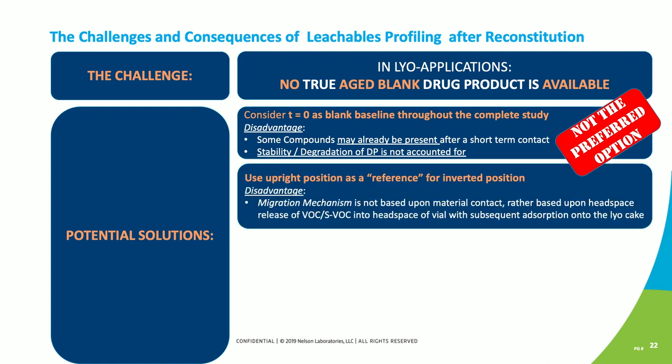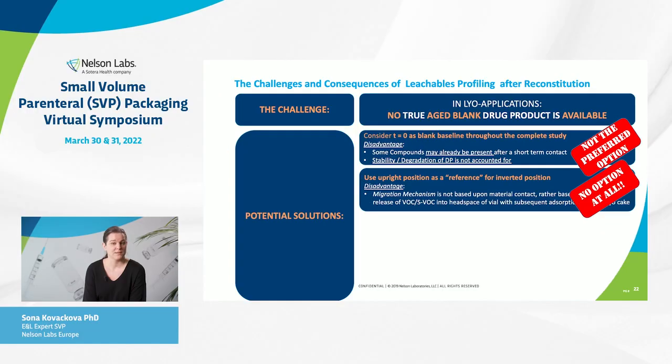The second option would be to use the upright position as a reference for the inverted position. But the mechanism of leaching happens through outgassing and not through solid-solid interaction. For us, this is no option at all.